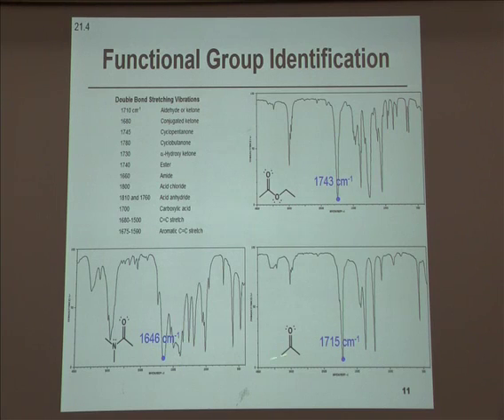The commonality of all three of these is that the signals are really intense. And again, that has to do with the fact that one of those atoms is a carbon and the other is an oxygen, and there is a big change in the dipole as that vibration occurs, resulting in a pretty big intensity.